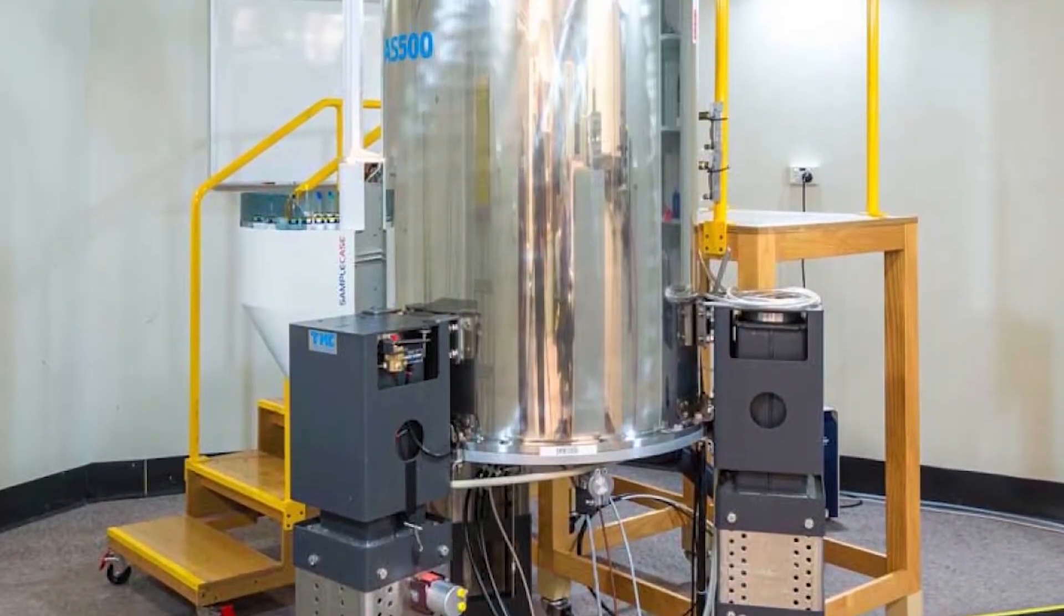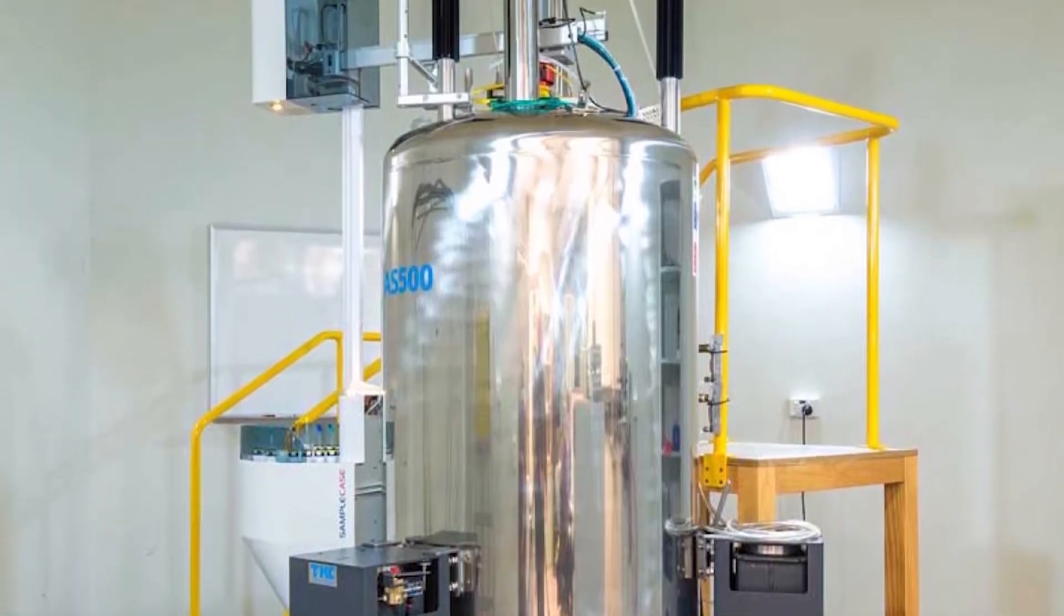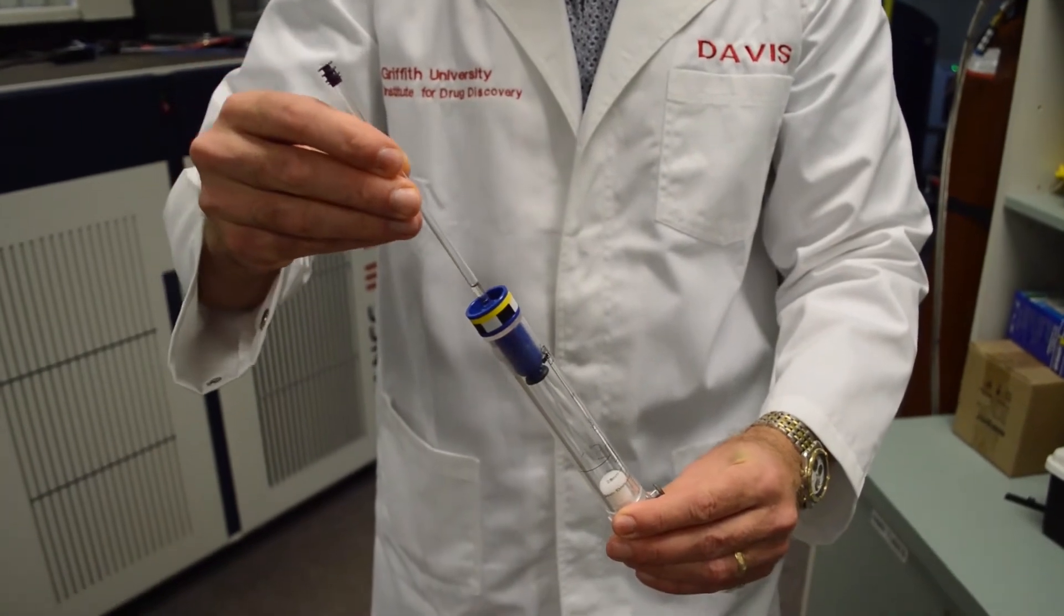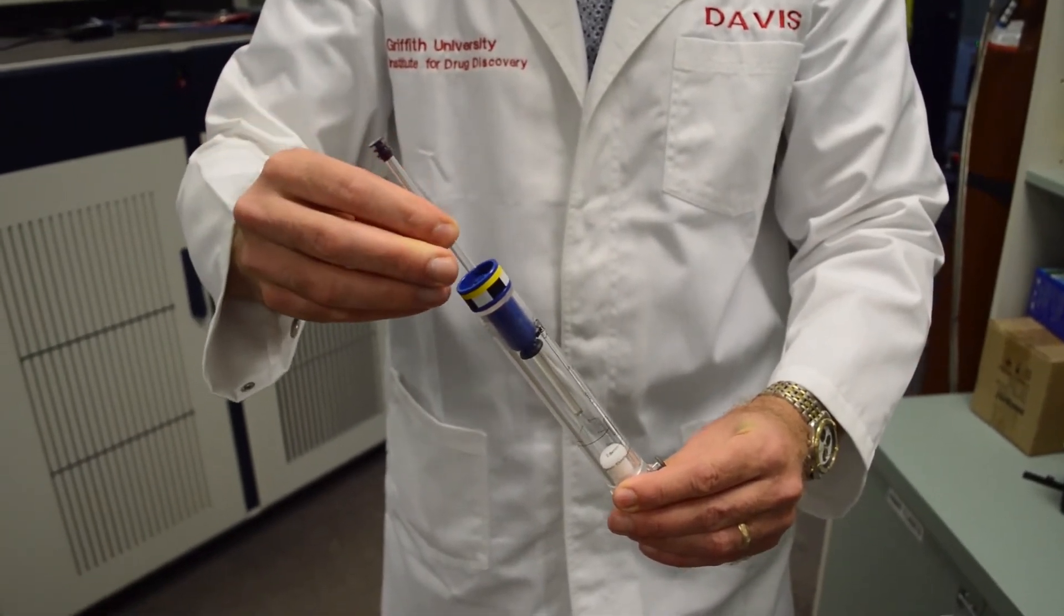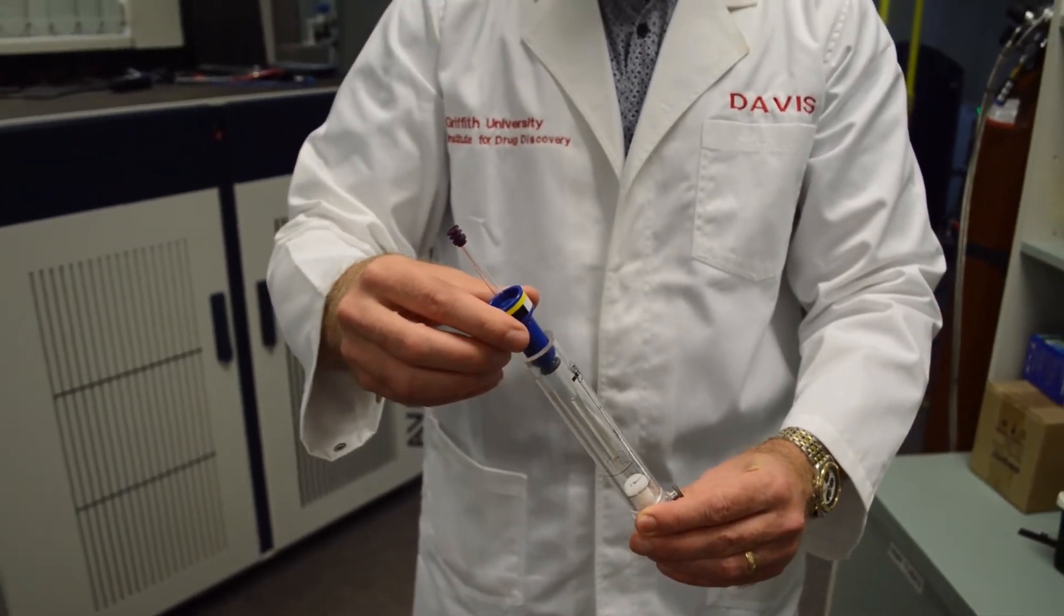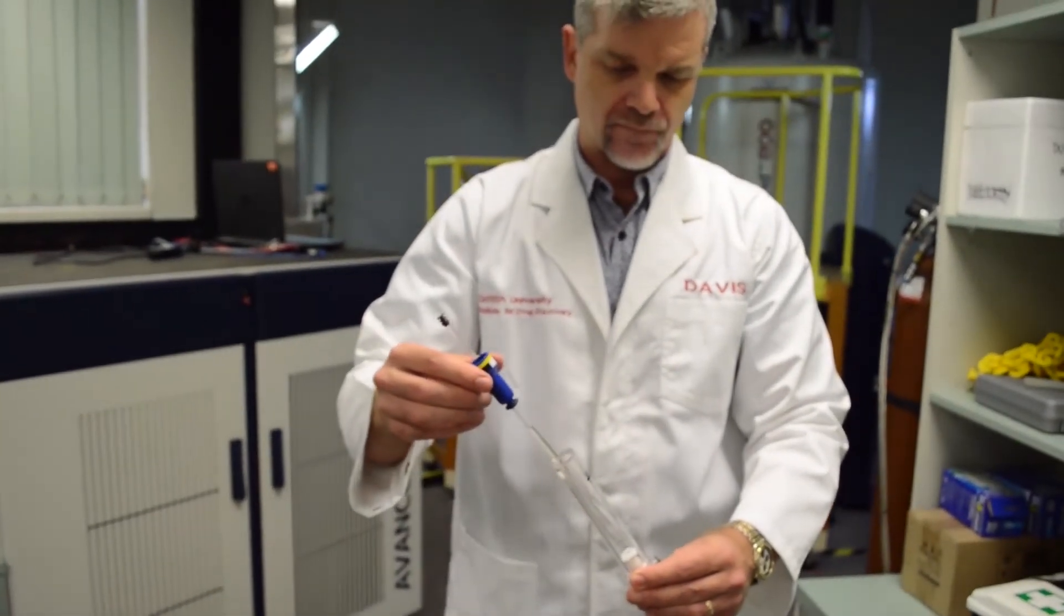This is an NMR machine. It consists of large superconducting magnets, robotics and an energy source. The NMR is filled with liquid nitrogen and helium to keep the magnets cold. We drop the sample of our natural product right into the centre of the magnets in order to analyse it.